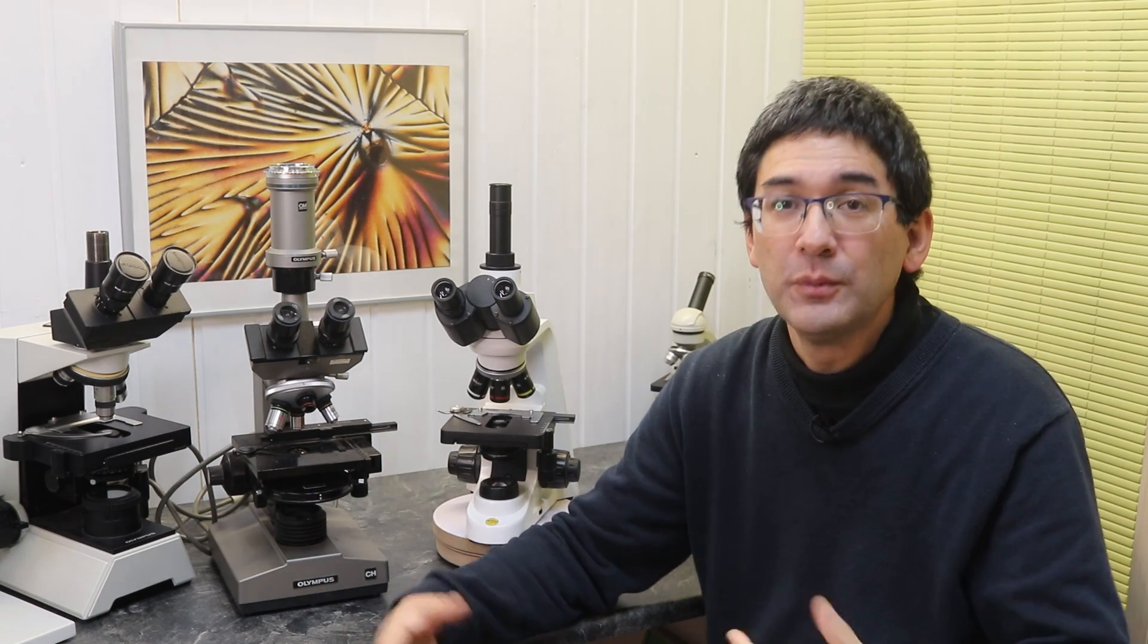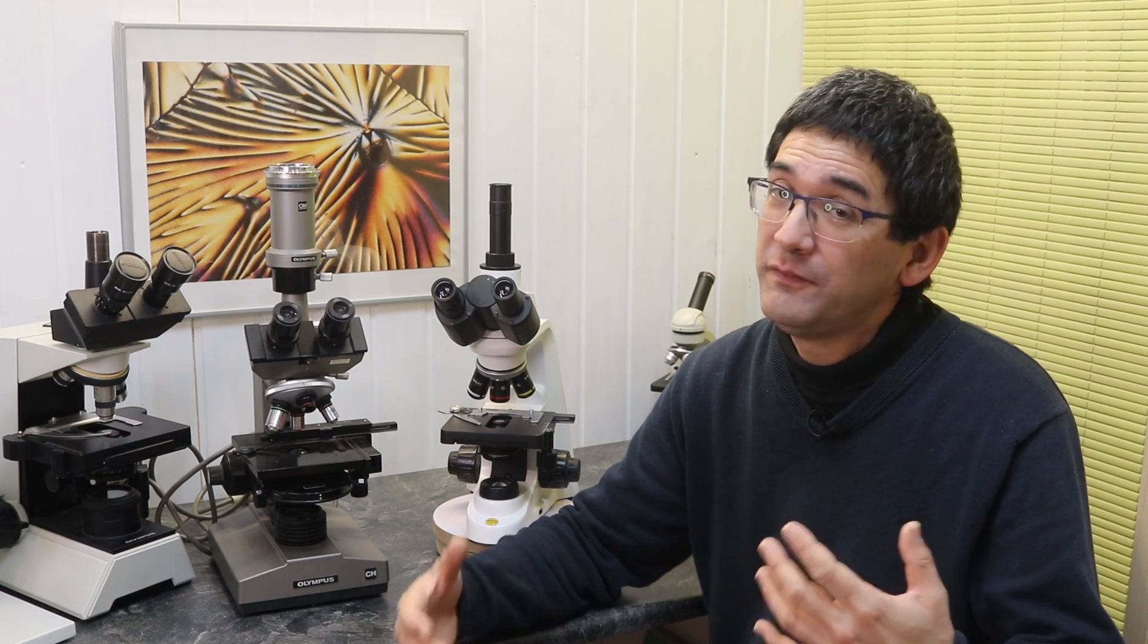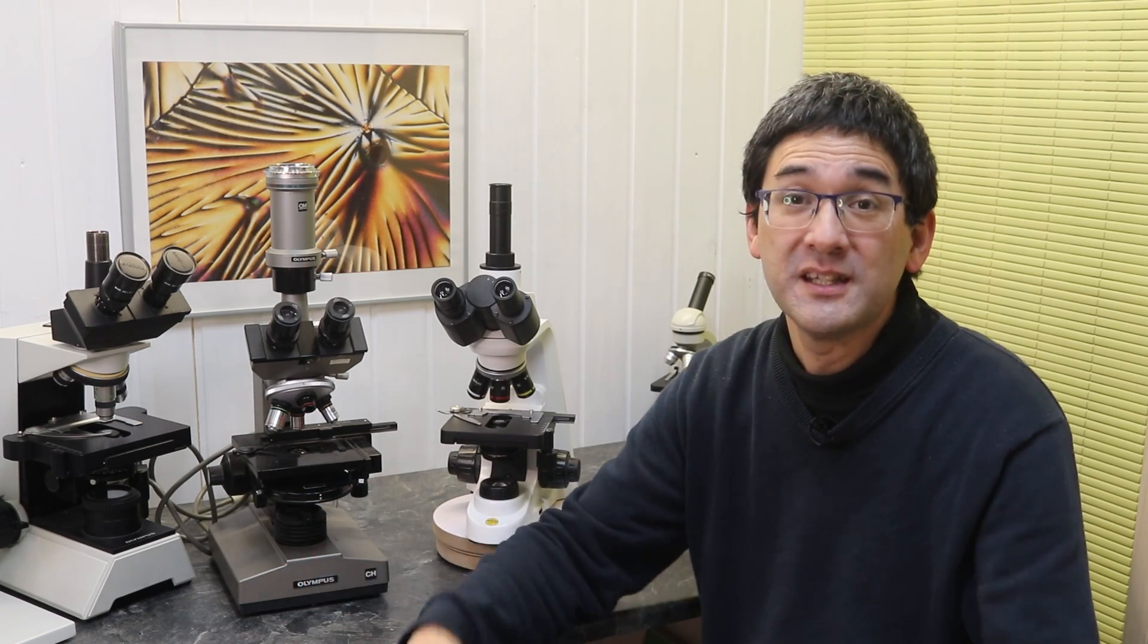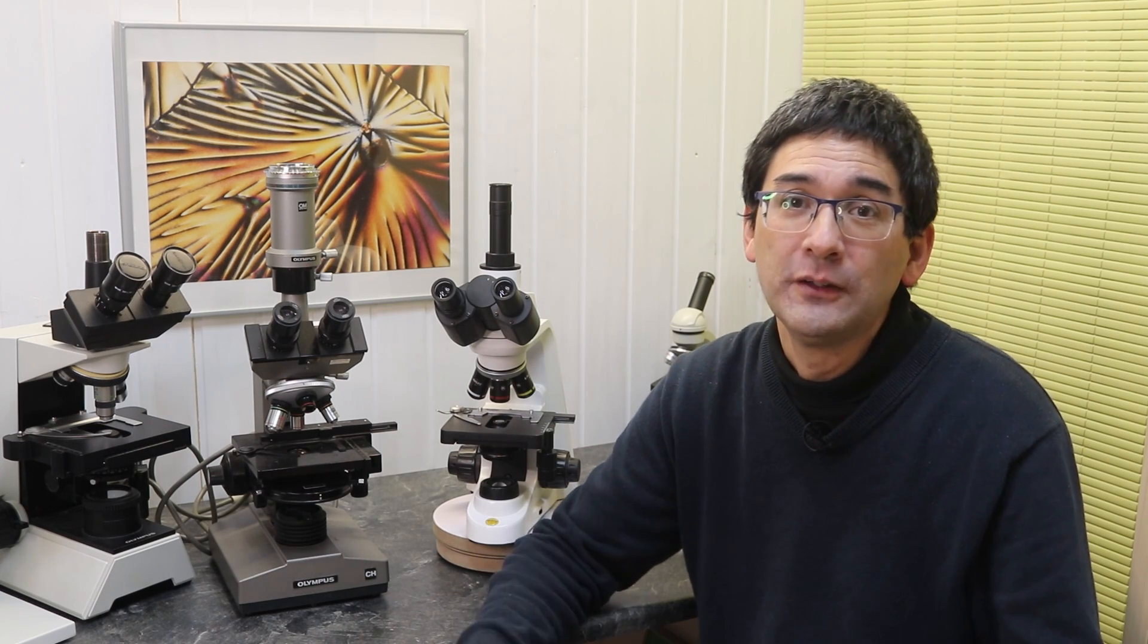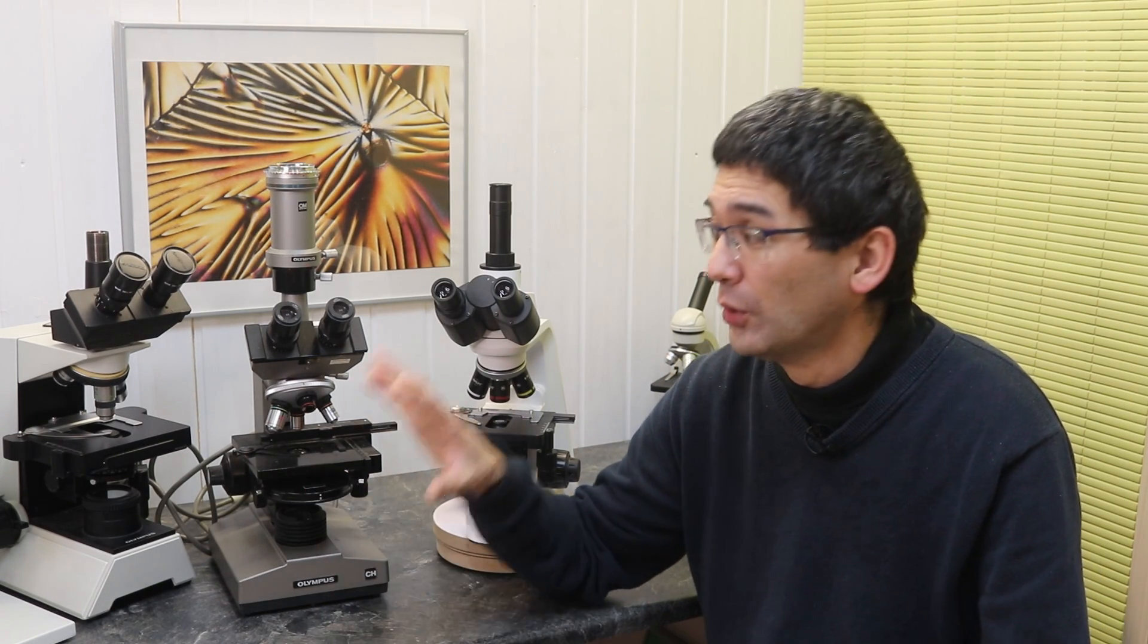If this is what you want to do then probably getting a used microscope is probably the better option. If you say I just don't want to do that, I just want to do nature observation right out of the box, then I would say that you're probably also going to be fine with a new microscope. And very much depends on the individual configuration and on the individual model. Generally I say if there is a controversy like this where there are pro and con arguments, then this is probably an indicator that there is no single objective criterion and that much is a question of taste.